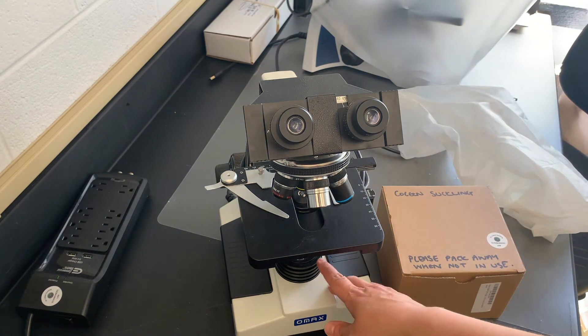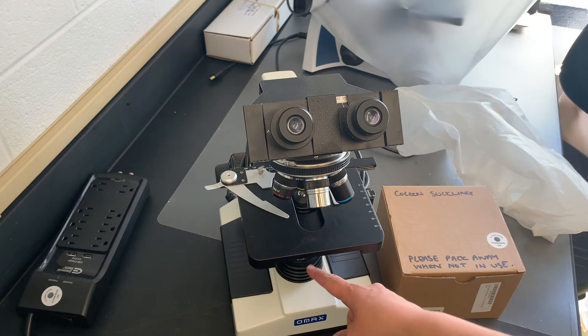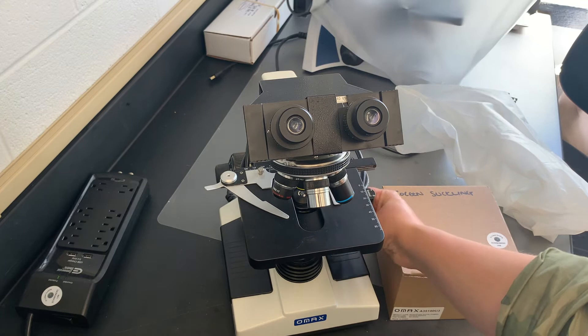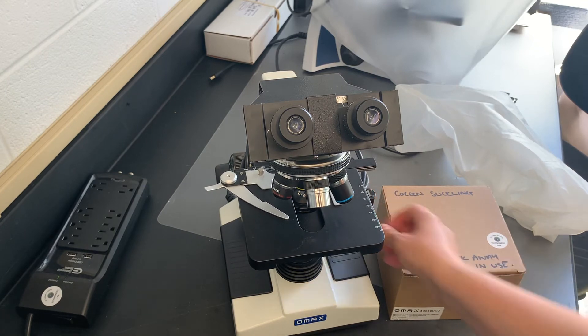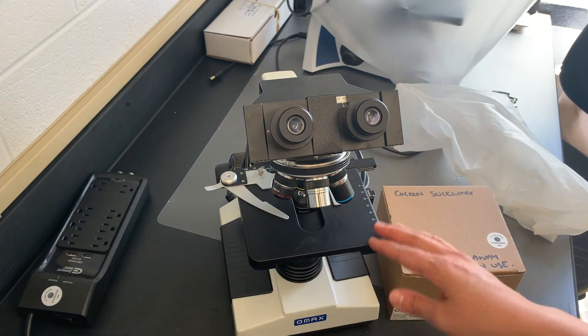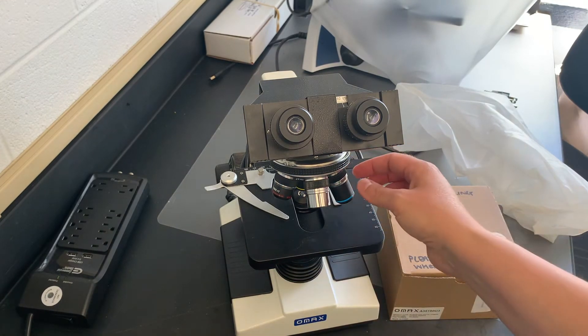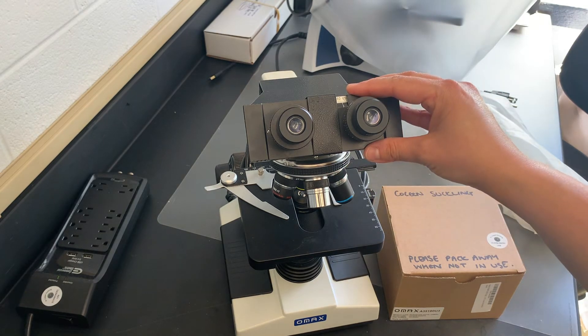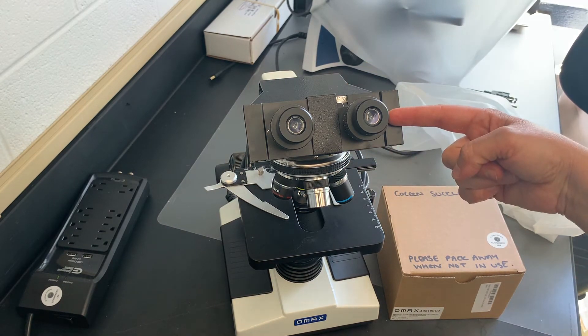Here you've got the base, the light source at the bottom, and here you have your stage, which you can move around with these adjusting points. This is the clip to keep your slide in place, and here we have our various objectives for magnifying your sample. You can look through the scope through these eyepieces.